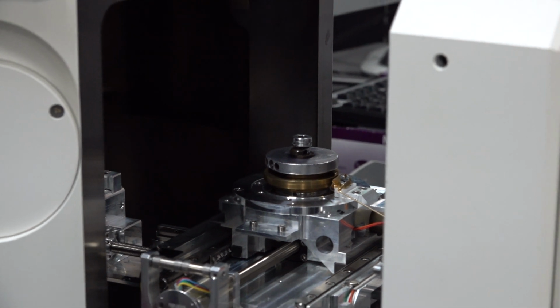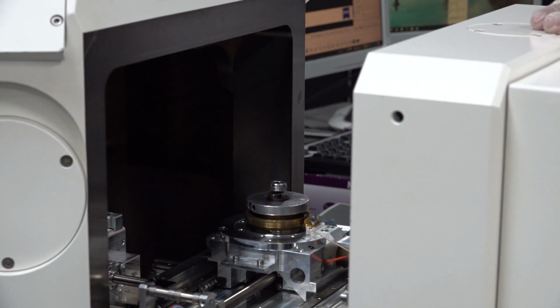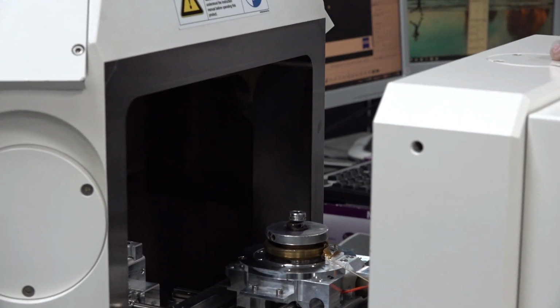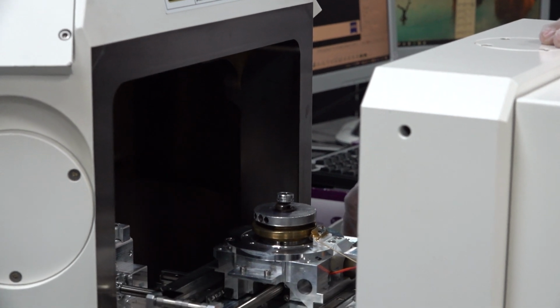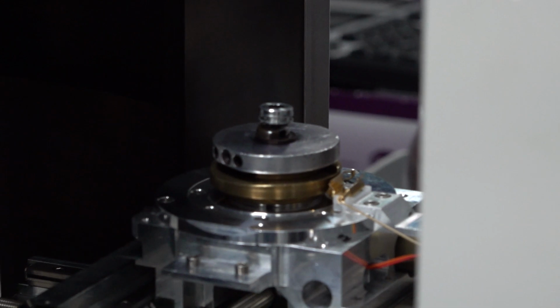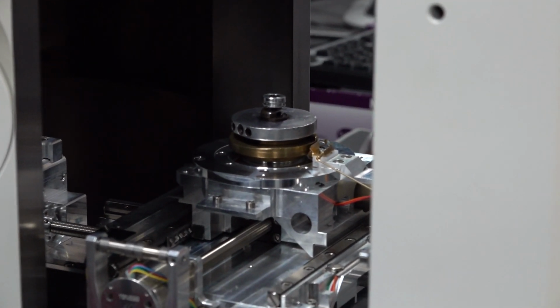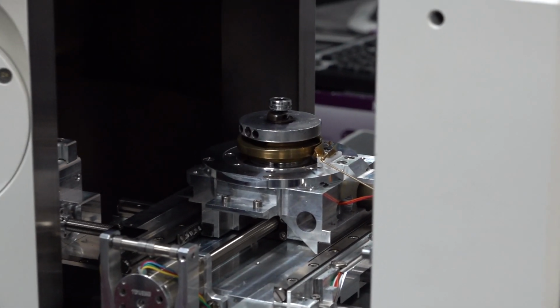Now this stage is an interesting thing. It has 5 degrees of rotation, like one is X. You can see the stage is moving: X, Y, tilt, or Z. So these are the operations of the stage. There are 5 operations. I will show you in a minute in the camera mode also.